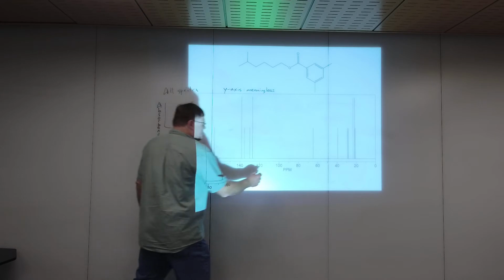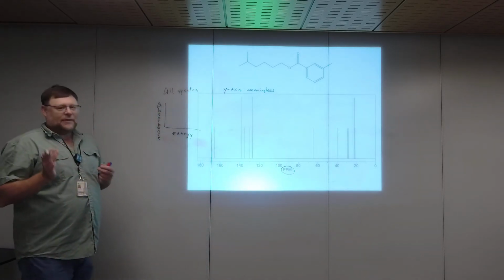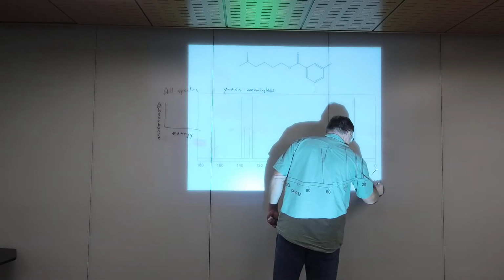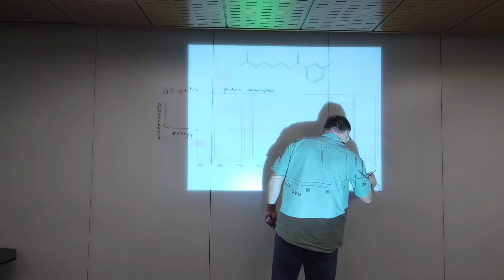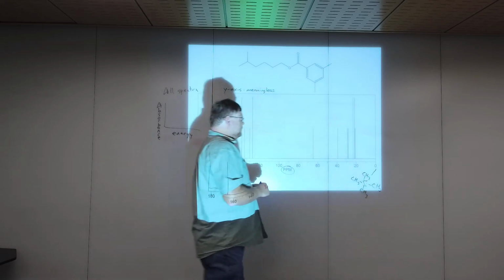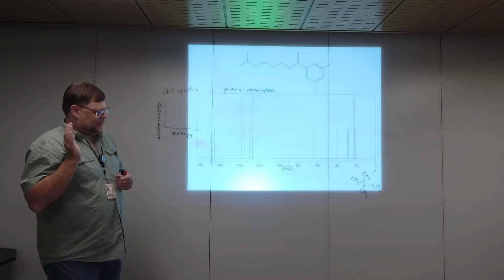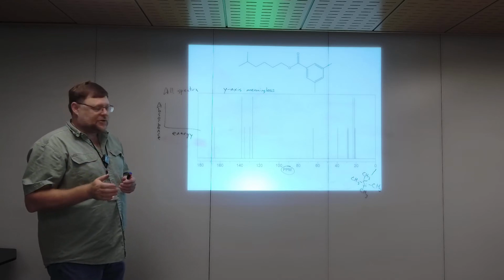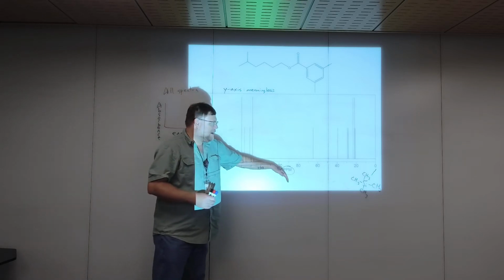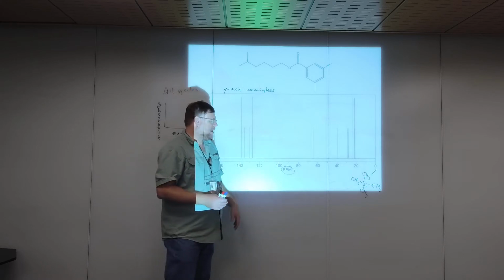And then the frequency axis is always going to be in parts per million. We have a reference, so at 0 is a molecule called tetramethylsilane. Silicon bonded to 4 methyls. The peak corresponding to the carbon in tetramethylsilane, we set at 0. And so we're looking at the energy shift from TMS. Again, I'm not going to ask you mathematical questions about this.